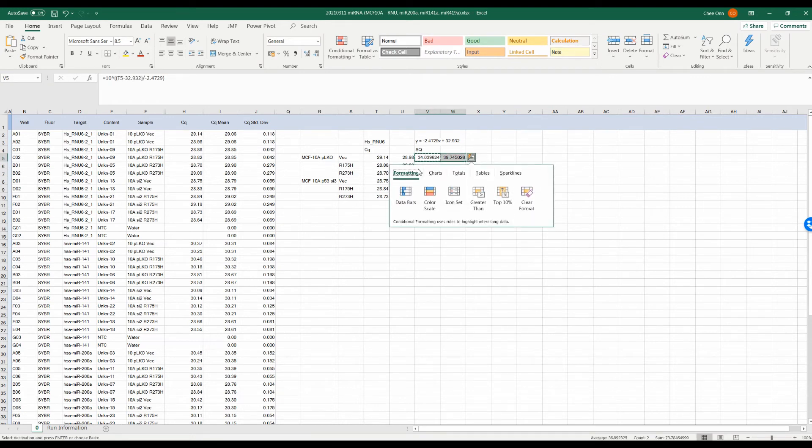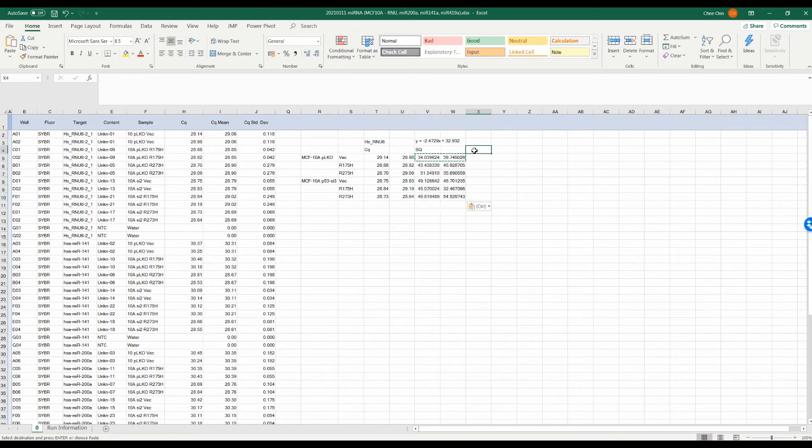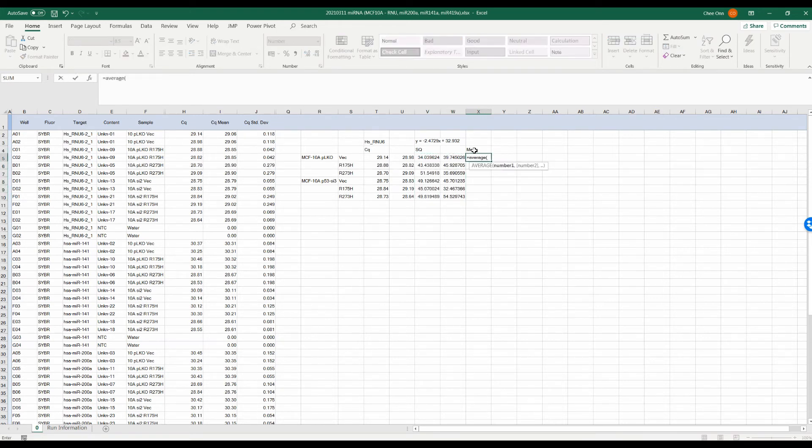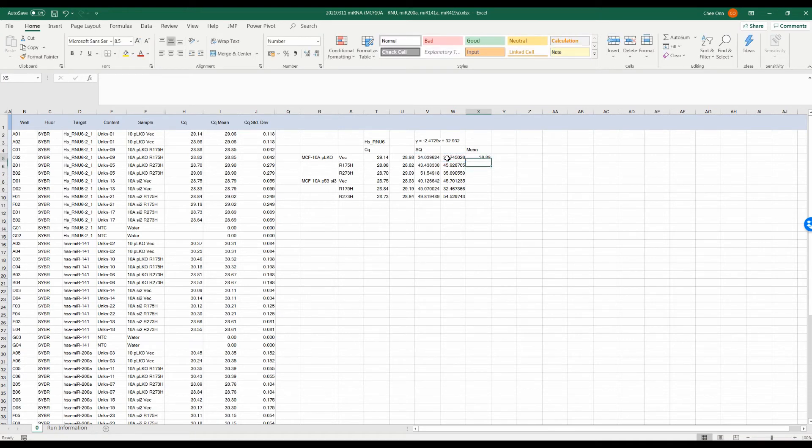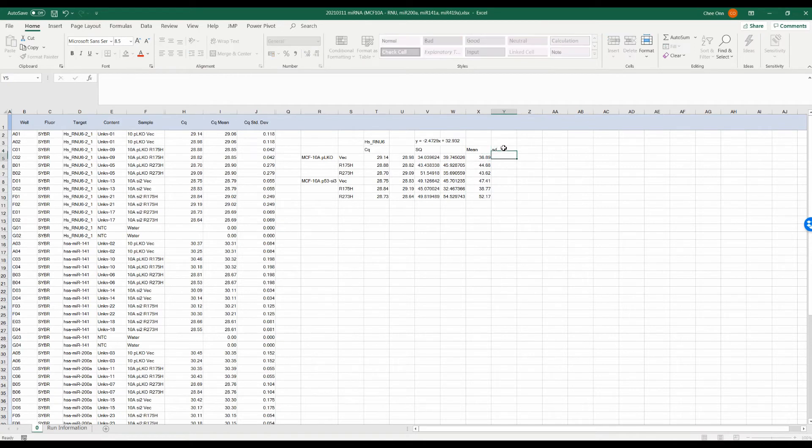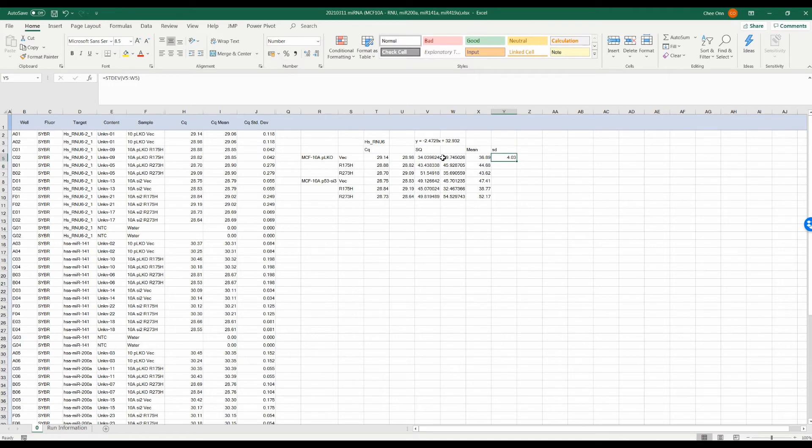To convert the CQ to the starting quantity, we will calculate the X value and then transform the value with anti-log. Once you get the SQ value, you can calculate the mean and standard deviation. In general, the CQ for each replicate shouldn't be more than 0.5. We will do this for the RNU6 first as it is our housekeeping gene.